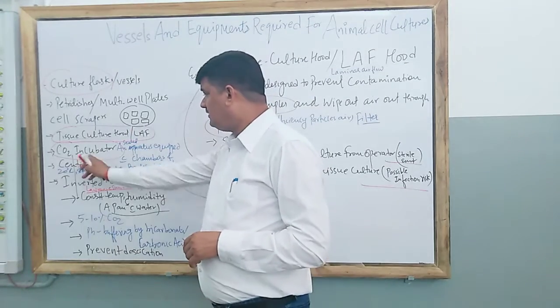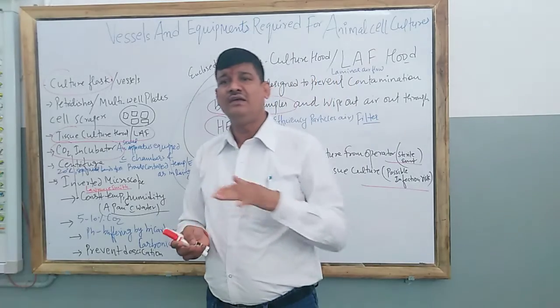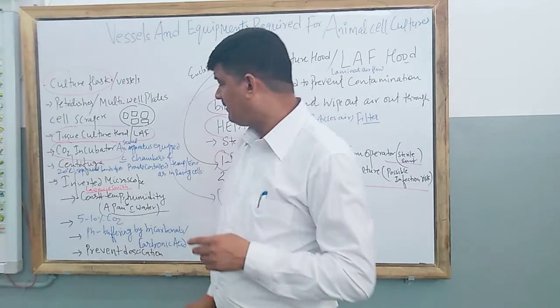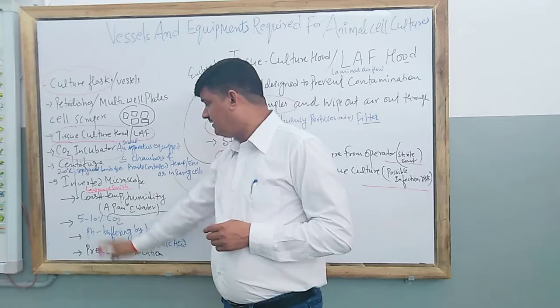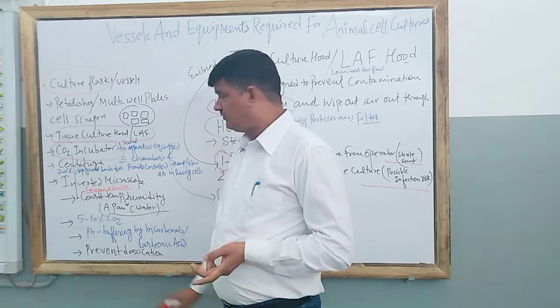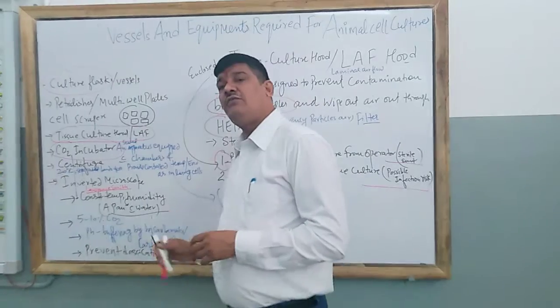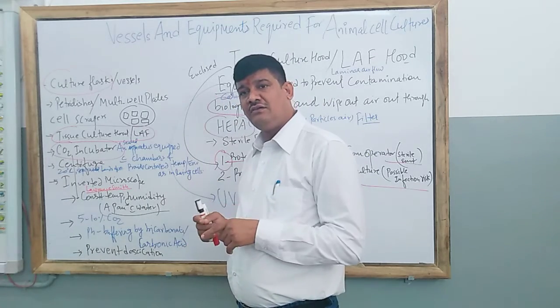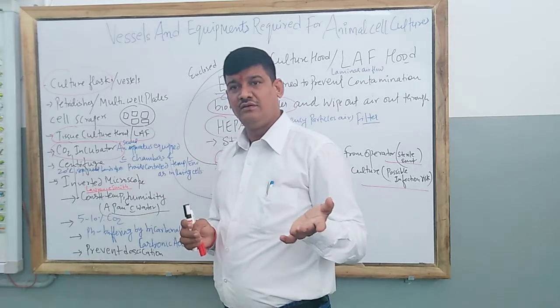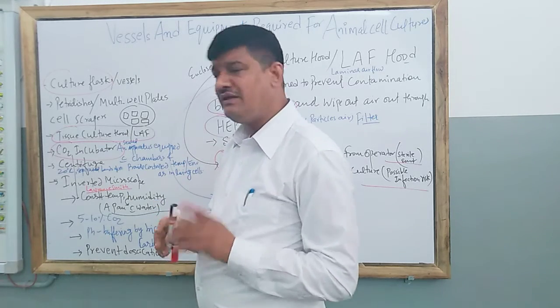So once again, the CO2 incubator is a sealed apparatus which has multiple chambers, and each chamber is designed with some concept or principle. For example, pH maintaining, temperature and gases maintaining, or humidity maintaining. So all these things are kept inside the incubator, and a pan of water is kept inside the incubator. The purpose is to make the real humidity that is outside. So outside and inside, temperature, humidity and pH will remain the same.